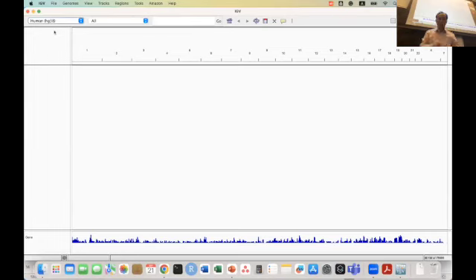So I wanted you to type like this. You want to go to some place, and let me put it in the chat. I want to go to the middle position of chromosome 1. The middle position is the 125 millionth position, right? So what I want to type is chromosome 1 colon.